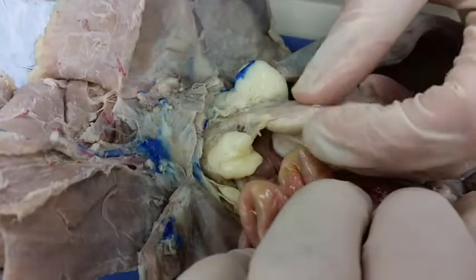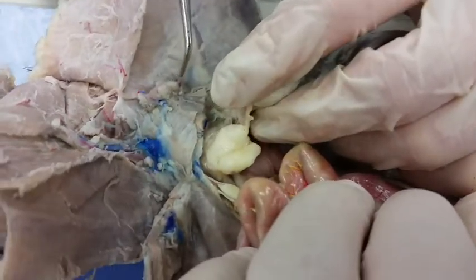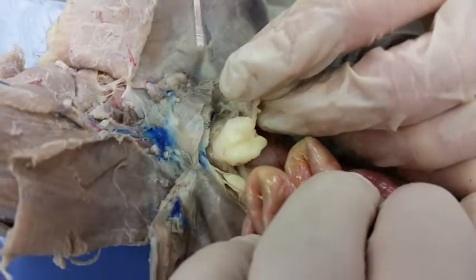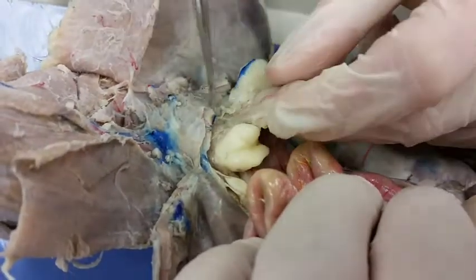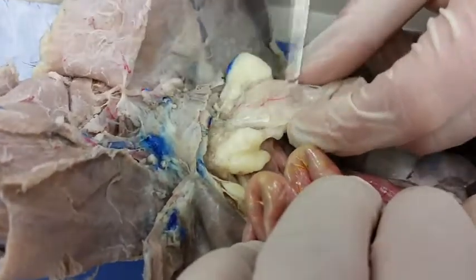There's a ligament associated with the urinary bladder called the median vesical ligament. It looks like it is, I think ours got cut away actually. I will say, Dr. Hendry, but there should be a ligament right there.